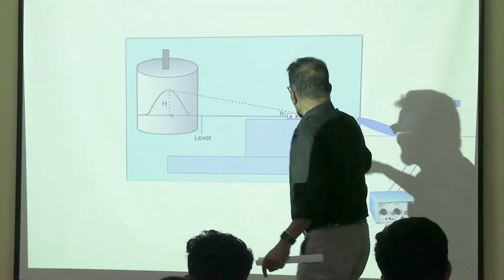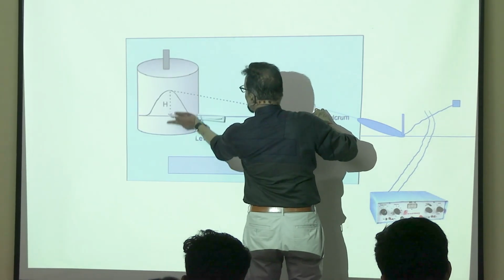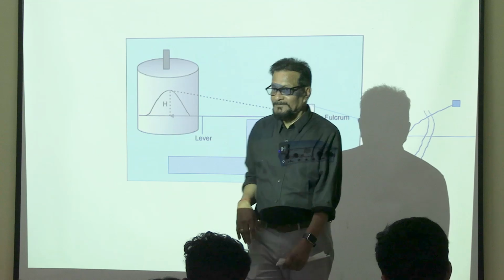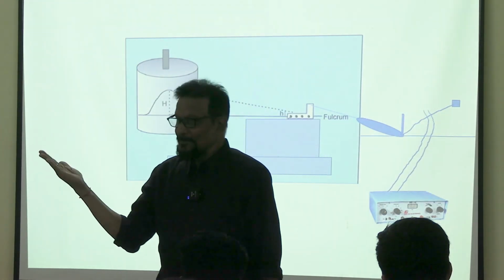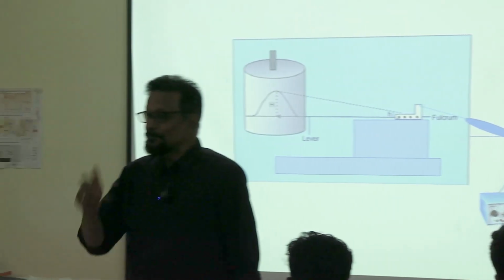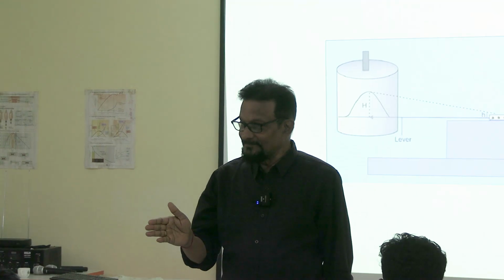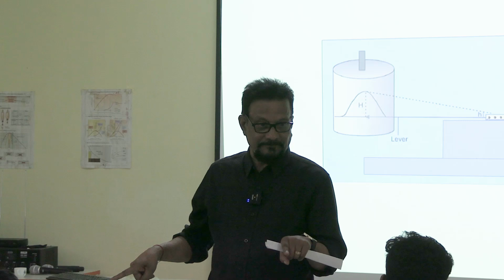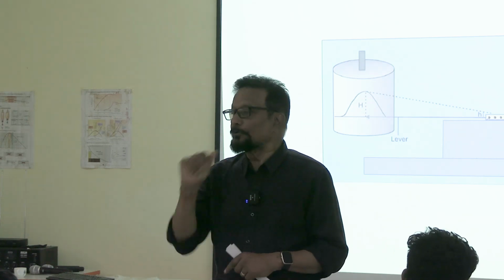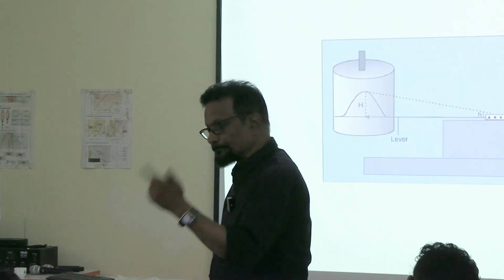Here is the fulcrum, so it will move like this and make an arc. So this will not be the vertical line. I am suggesting you make a vertical line with your pencil. Then you can go up to the time tracing and very easily calculate. Is that clear? Doubt gone?